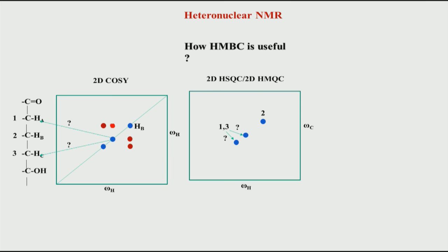All our arguments here are based, simply and intuitively, on the connectivities, and this is how NMR typically works, that we normally go by first the chemical shift correlations, then by the connectivity information, and then third is by using chemical shift values also. But chemical shift values, as I mentioned, is not always reliable, because there could be many factors which affect the chemical shift values. So, one should be cautious in directly using chemical shift value information. Therefore, we go for this correlation.